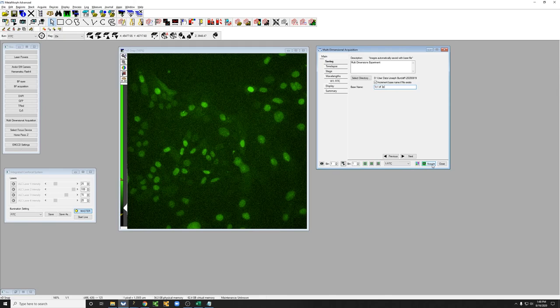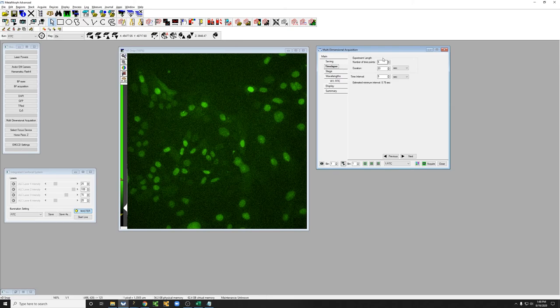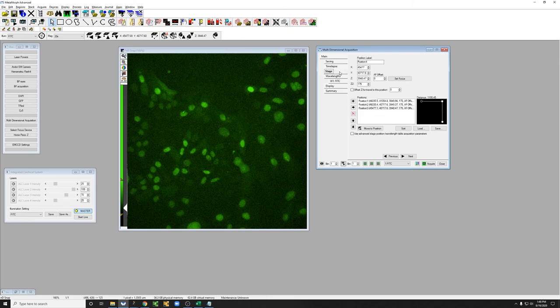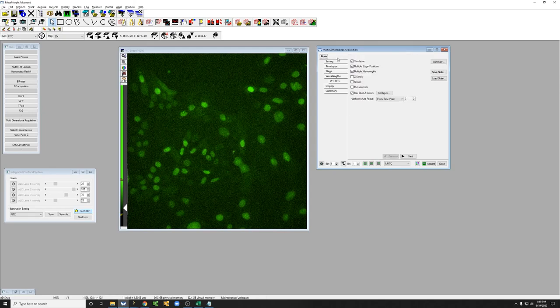And so what it should do is take five time points, where each time point it takes one channel at each of these three positions, and it autofocuses at every time point. And it also autofocuses at every position.